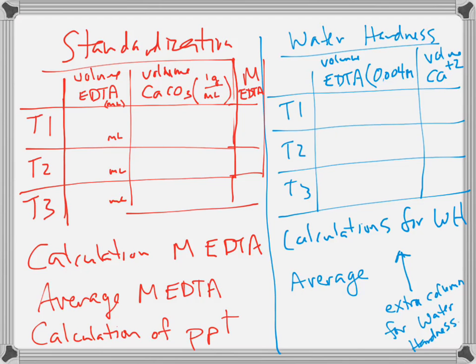The calculations you may handwrite, but like I said, most Word document software will give you some kind of equation editor. Yes? What does it say after EDTA on the second chart? I can't point to it quite right. Up here? Yeah. That's the concentration of your EDTA solution. In this case, I'm going with what it's supposed to be, relatively. If yours is way different, that's fine. Just report what it is. You should report that because you know what it is, and so it should show up in the table.